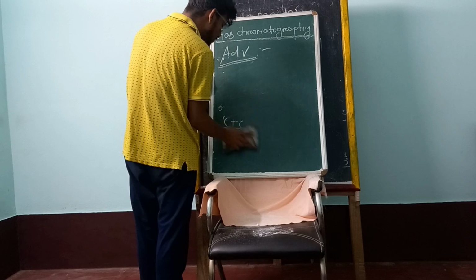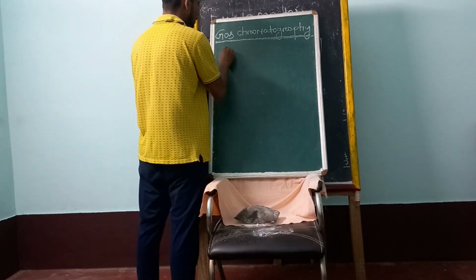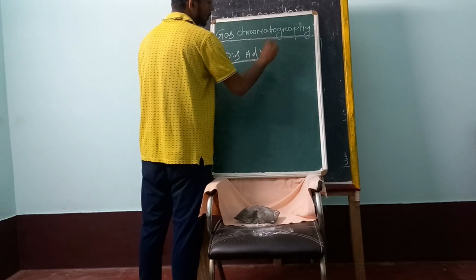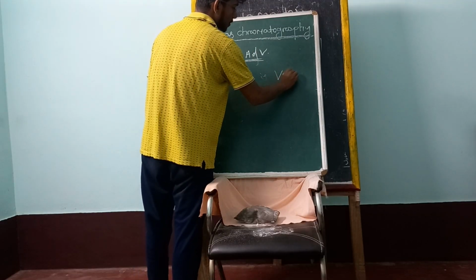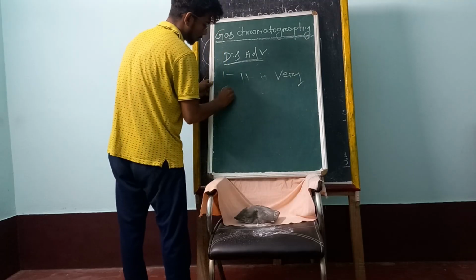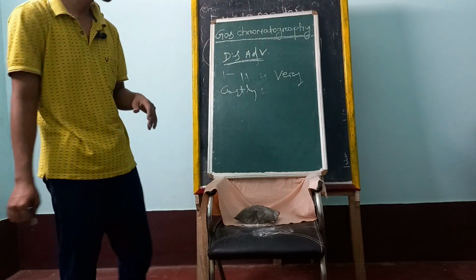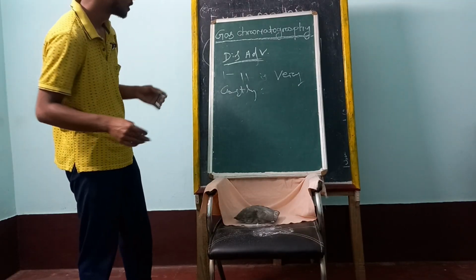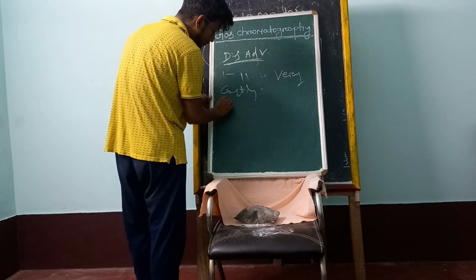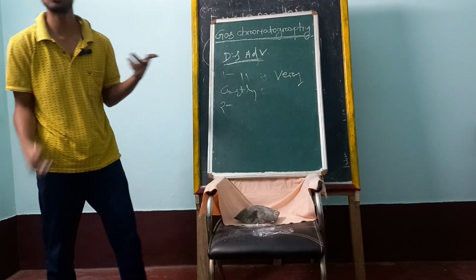And there are disadvantages. Gas chromatography is very costly. It is a very costly instrument, so we have to handle it very securely and safely. And second, the eluted material has no further use.